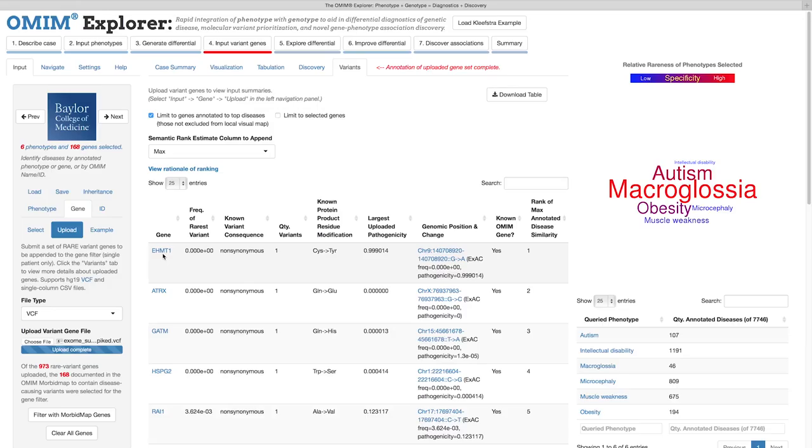OMIM Explorer prioritizes variants using a guilt-by-association approach, which ranks variant genes as a function of the query match scores of the diseases they're linked to.